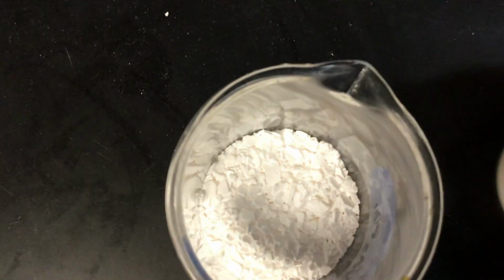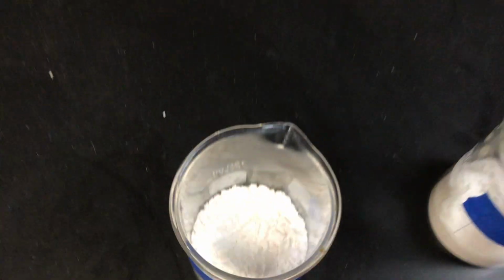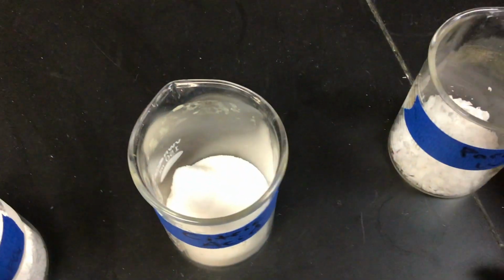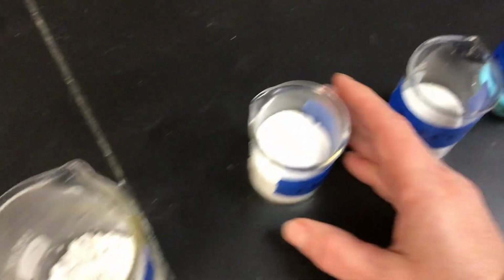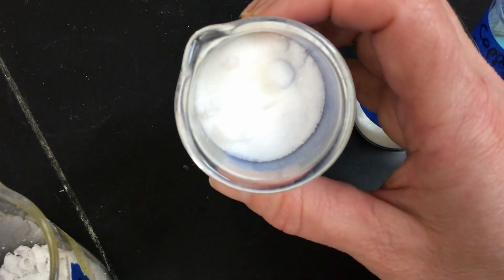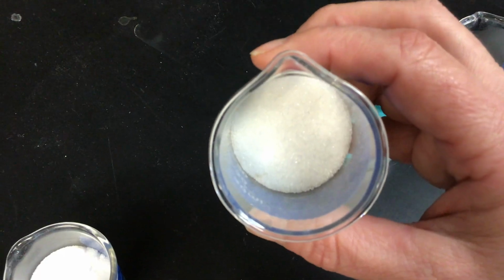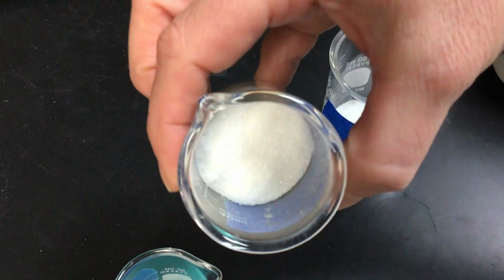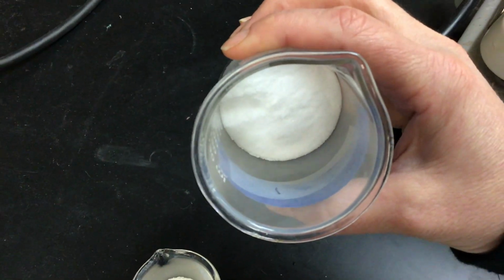All right, so the one she's showing you right now, that's calcium chloride, okay? Now she's going to move over and show you citric acid, okay? That is citric acid. Next is paraffin wax, okay? That's paraffin wax. Then you have sodium chloride. That is sodium chloride. Then you have sucrose, okay? Then you have copper chloride. Then you have unknown number 1 and unknown number 2, okay?